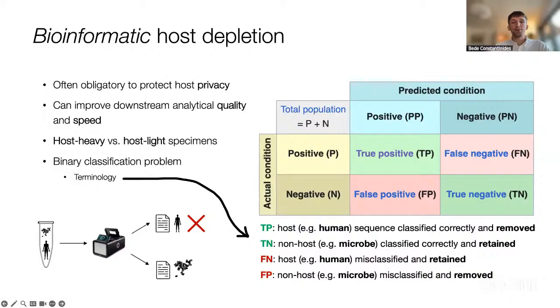So this poses a challenge for classification. Starting with a mixture of microbial and human sequences, we attempt to filter out the human sequences. We do this often out of obligation to eliminate personally identifiable information and protect donor-host privacy. But also, human sequences can actually harm some microbial genomic analysis, such as taxonomic classification, and particularly things like de novo genome assembly.